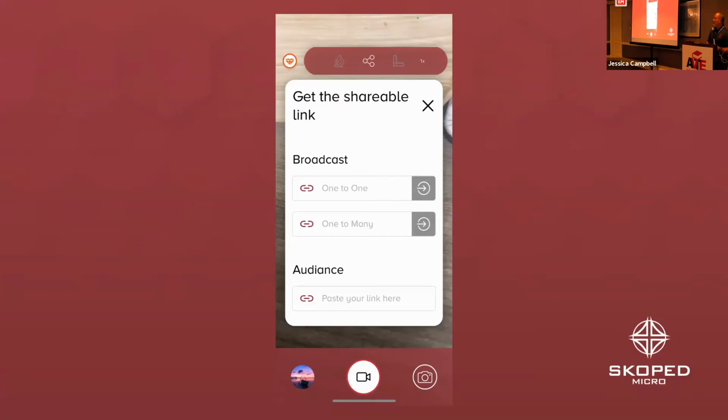The one to many is what we're here to talk about. A lot of you guys are teaching technicians, probably all of you. Otherwise, why are you here? The idea on this is the ability, whether they're in your classroom or not, to share your screen, share how you would go through a slide, or show the little idiosyncrasies of parasitology or hematology or microbiology or whatever it is.